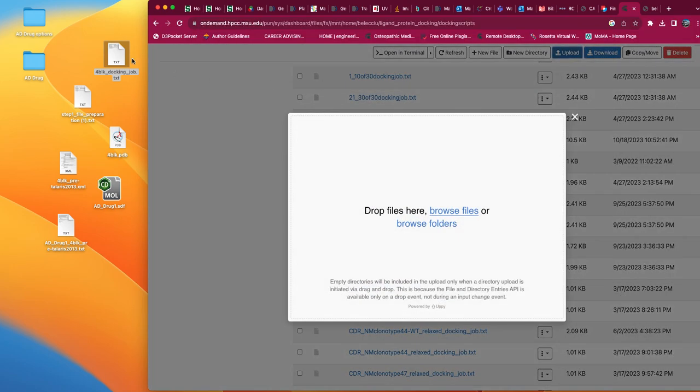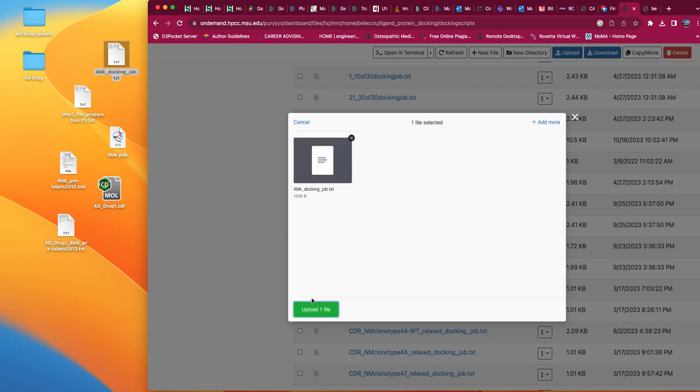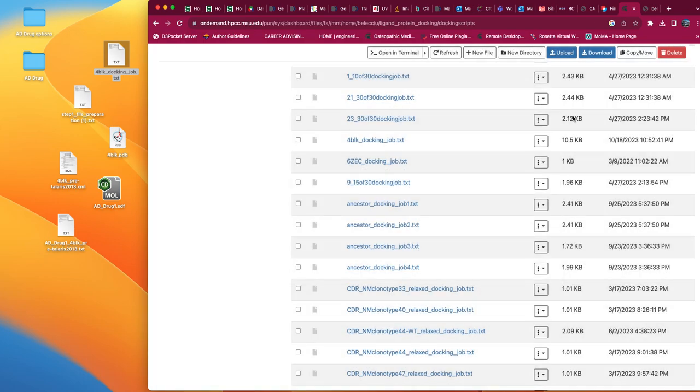And let's upload this modified one. And just one of these dockings, given that it's 1,000 outputs, would take about a day and a half to run, assuming it gets submitted in the queue within a couple of hours of you actually running the docking command. I don't know why it's not uploading, but whatever. It's okay. No, it's good.